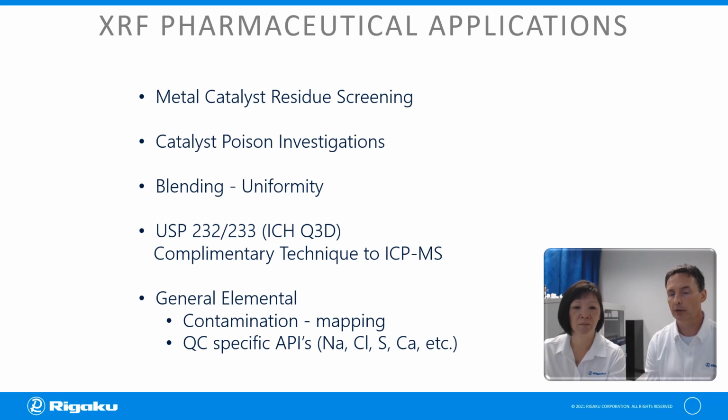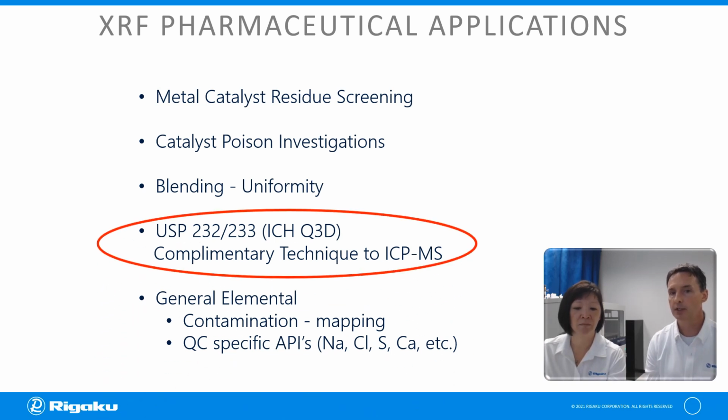But what we want to focus on in this session is USP 232. But keep in mind that this direct analysis technique could be used on other things. It doesn't have to be just for the heavy metals analysis.